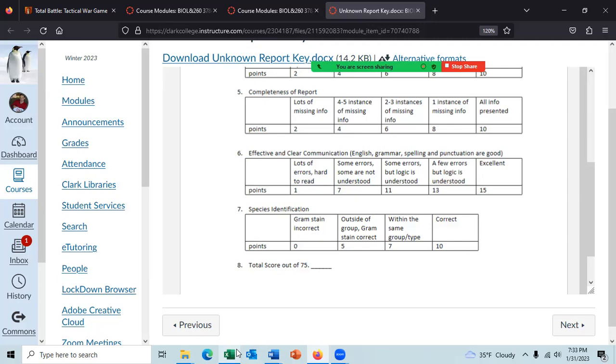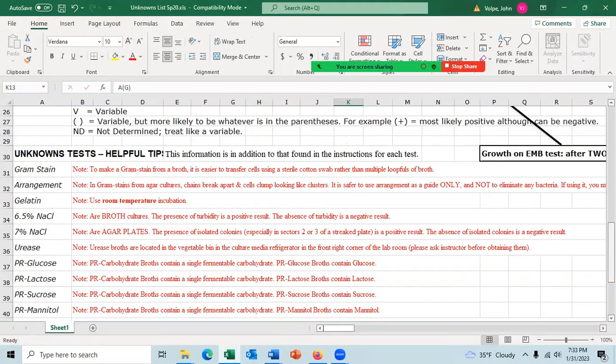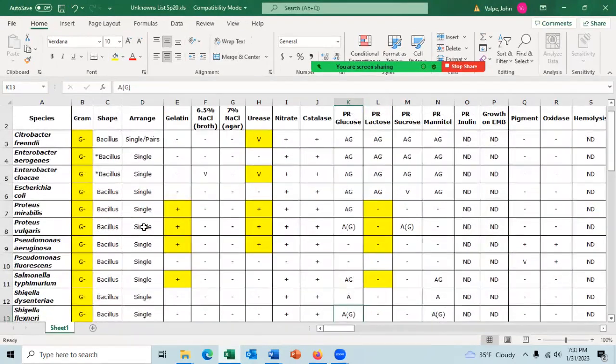As I stated, you will want to think about it, take a look at the table, what the possibilities are, and it's probably easiest if you start selecting what your possibilities are, and then figure out what test you want to run.